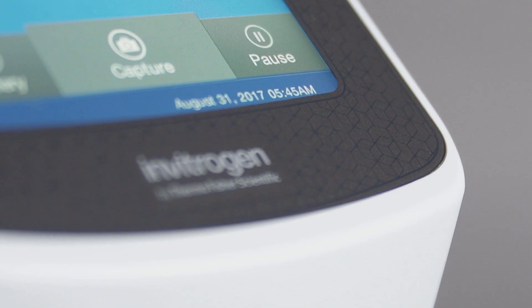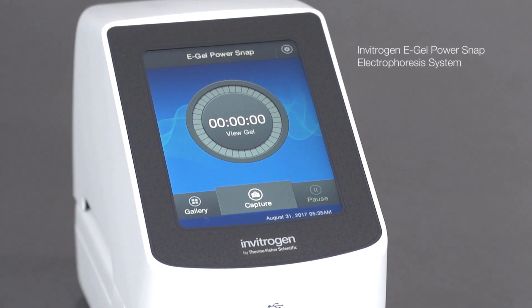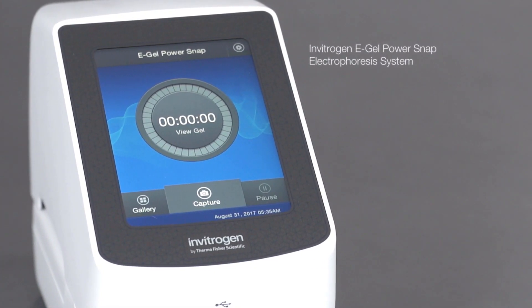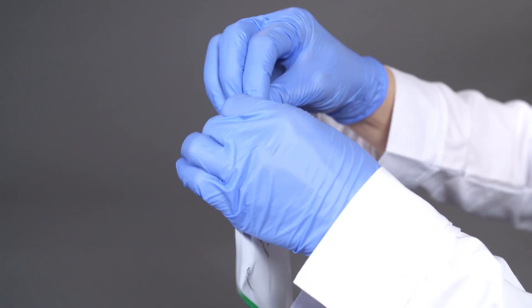In this video we will show you how to simplify agarose gel electrophoresis and analysis using the Invitrogen eGel PowerSnap electrophoresis system. We will now demonstrate the eGel CloneWell2 agarose gel run.